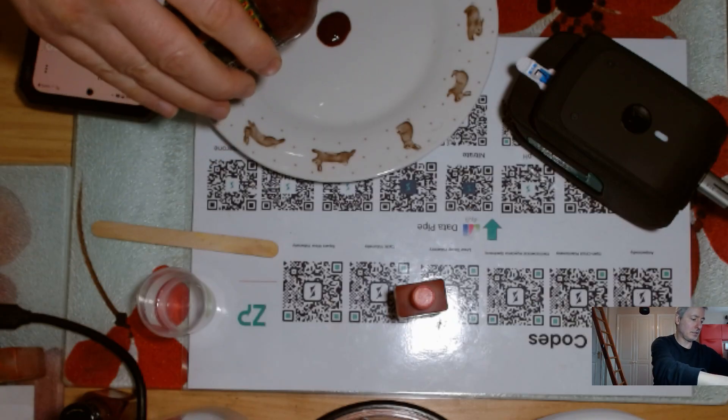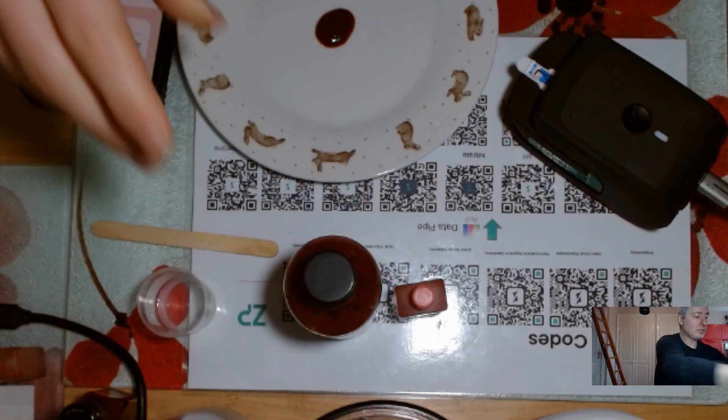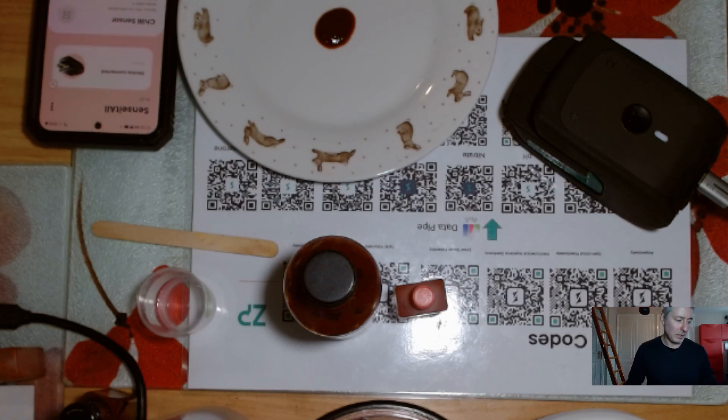I kind of think I should put some gloves on. You feel like, because it's a kind of a sauce it's fine, but actually it can be quite painful if you get it on the wrong parts of you and if you rub your eyes, etc. So maybe I should have — I generally say you should actually put gloves on. With that said, I'm going to dive in and do a quick demo.